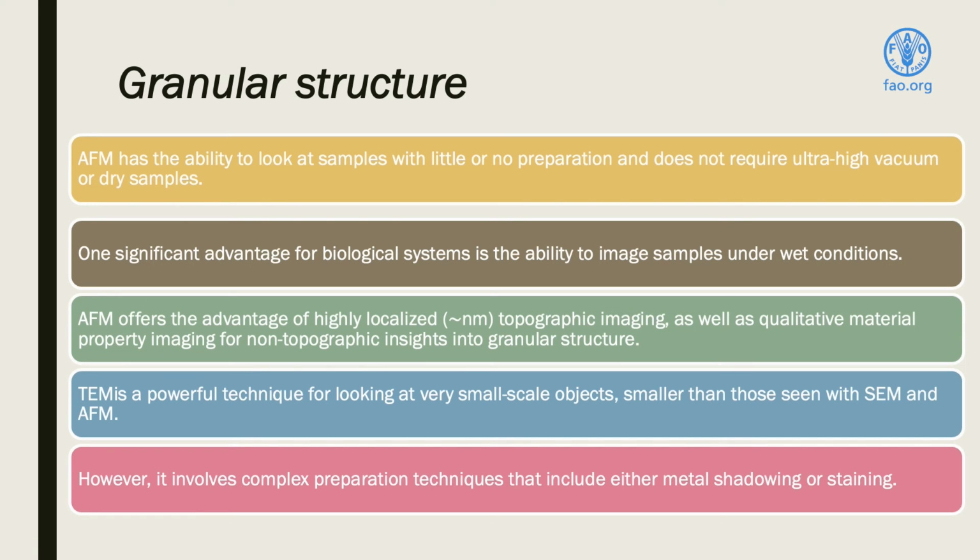AFM has the ability to look at the sample with little or no preparation and does not require ultra-high vacuum or a dry sample.